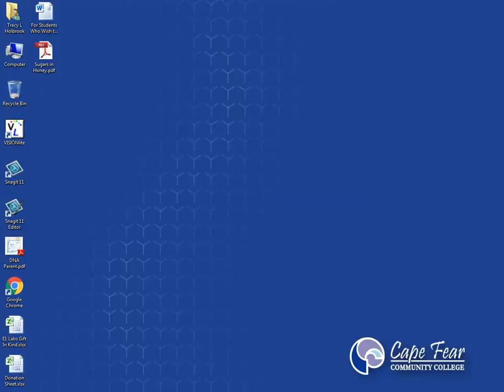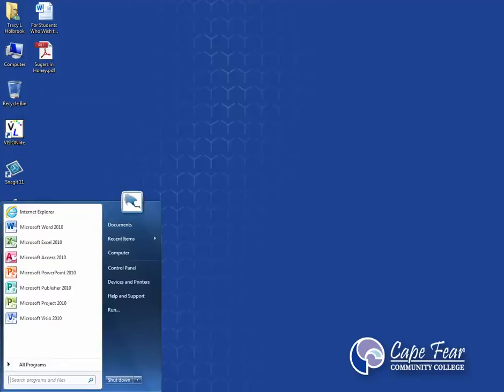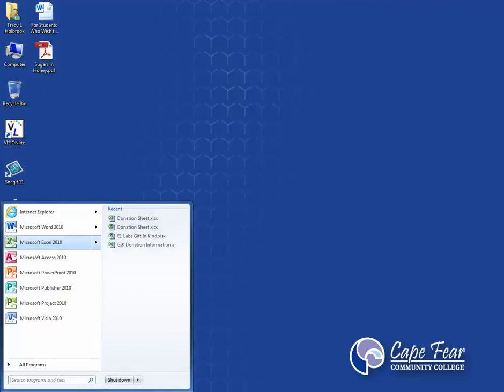So here is the desktop on my computer, but whichever computer you decide to use, you will probably have access to Microsoft Excel. Microsoft Excel, of course, is part of Microsoft Office, and that's the spreadsheet template that we want to use when we go into the actual data processing of the standards and the samples that are given to me, either for my lab practical or for the competition or for whatever reason is out there.